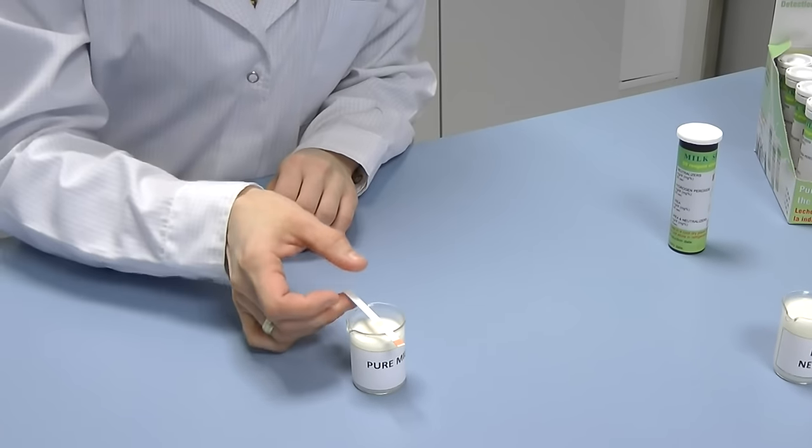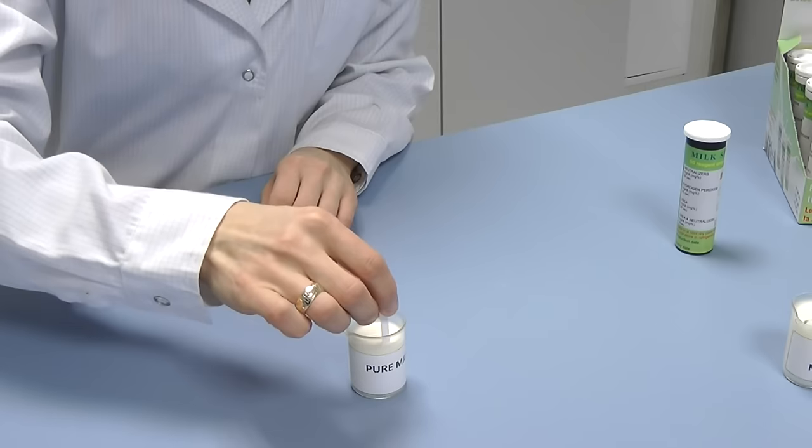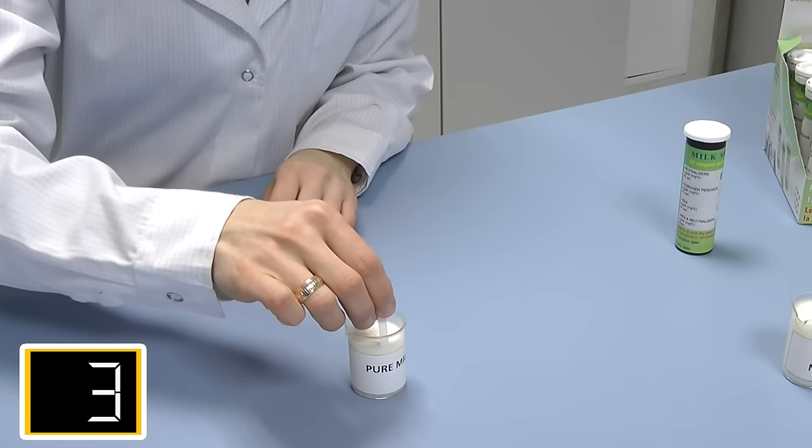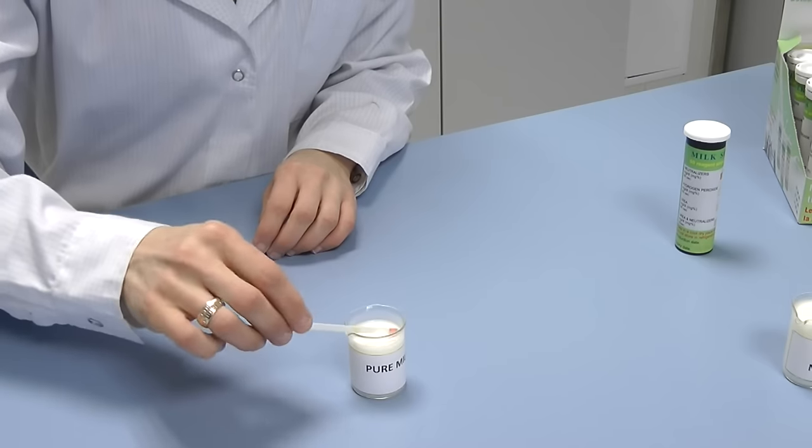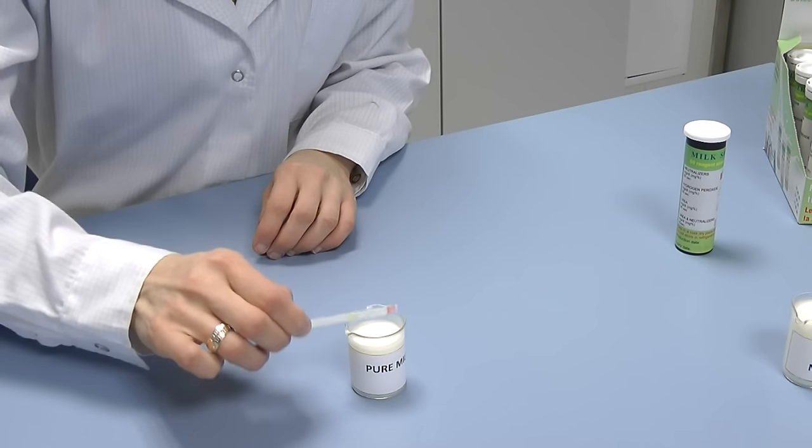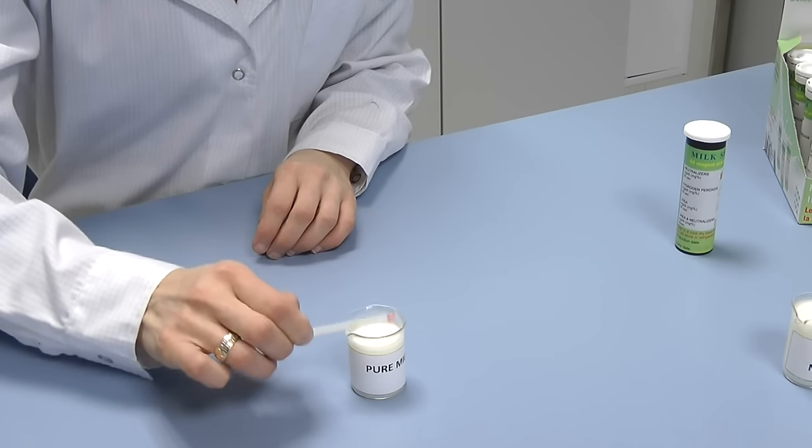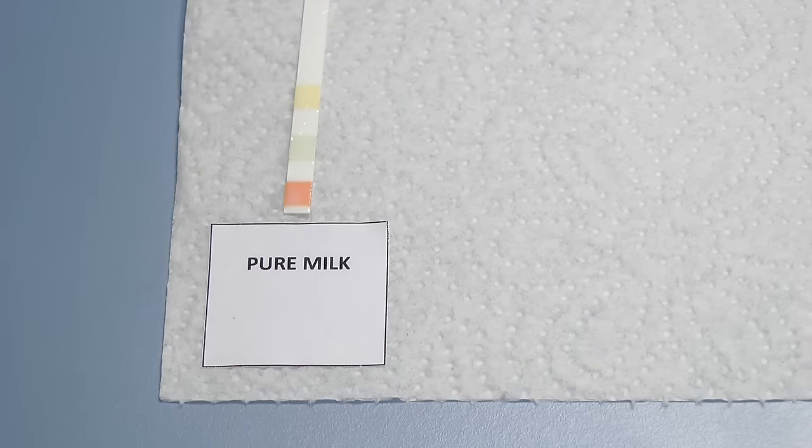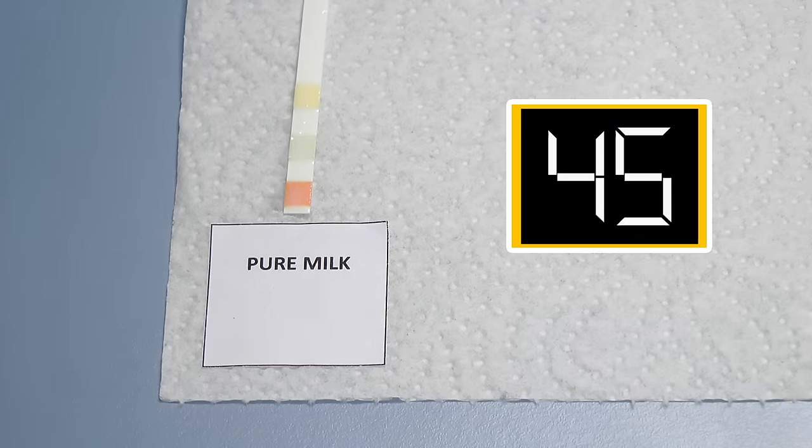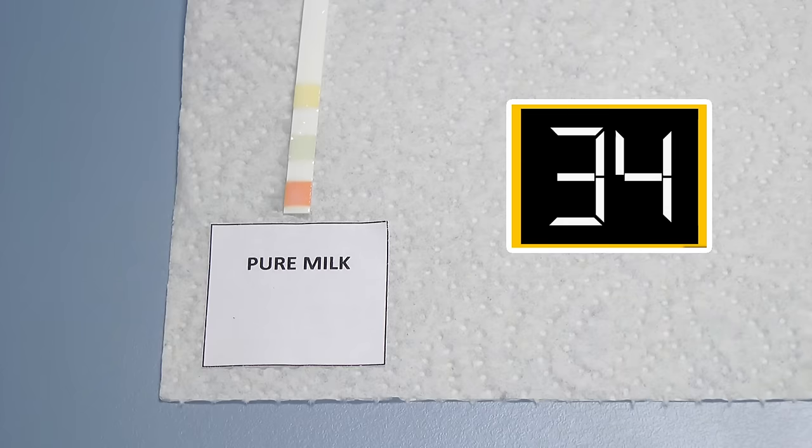Dip the indicator zone of the test strip in the milk sample, leave it there for 3 seconds. After the test strip is taken out of the milk sample, completely remove all milk drops from it by tapping on the edge of the cup. Place the test strip on the paper towel for complete absorption of the milk residues. Wait 60 seconds.